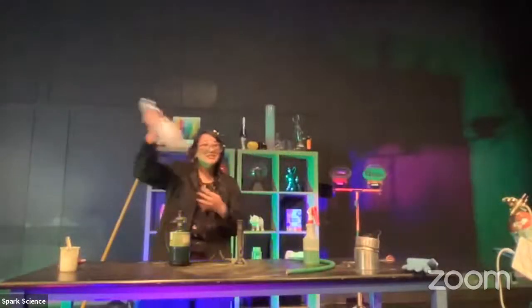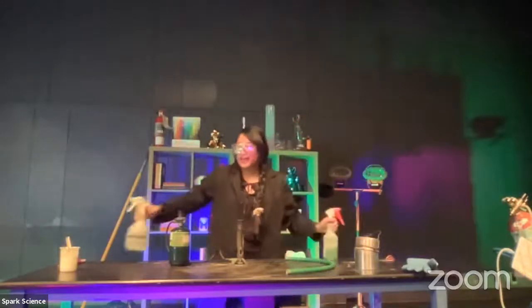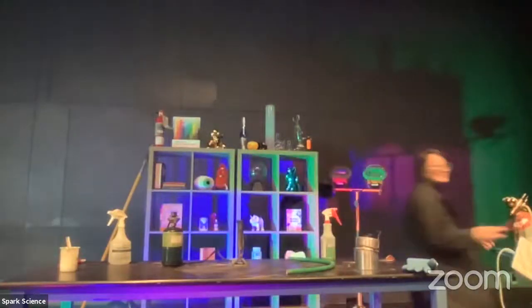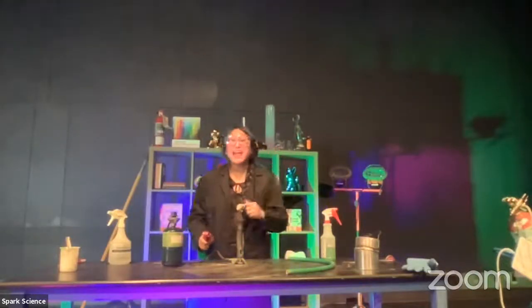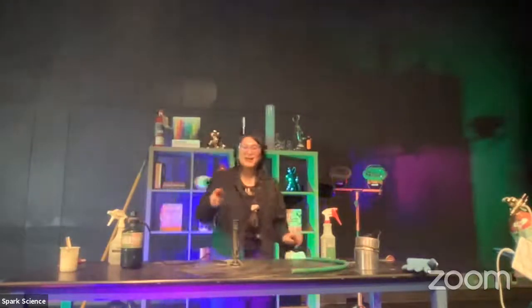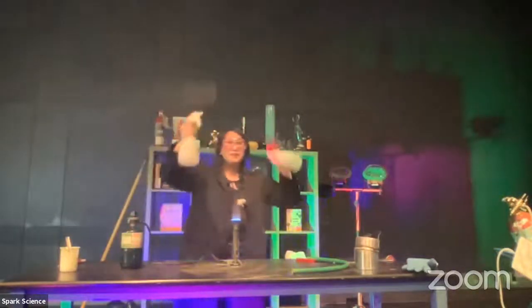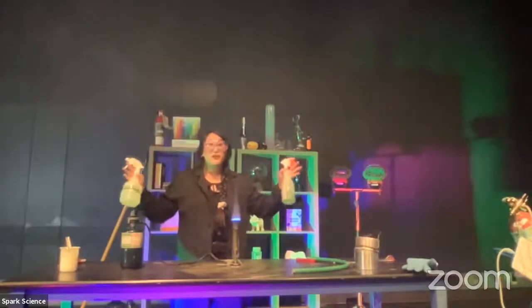Inside of these containers, I have mixed in those metal salts with an alcohol, ethyl alcohol, and I'd like to show you why fireworks burn different colors. Now I'm just going to grab my lighter here. Remember the fire triangle. We need a heat source, a fuel source, and most importantly, oxygen. So let's complete the fire triangle here today. Let's add our heat source. Bam! We're going to have our fuel source right over here, our strontium and our copper chloride, and finally oxygen, which is everywhere around us.